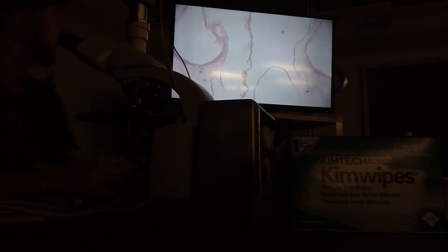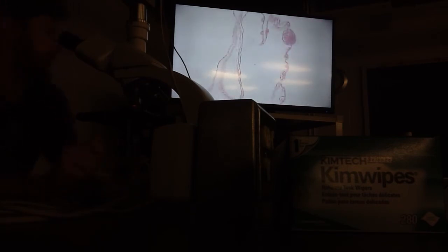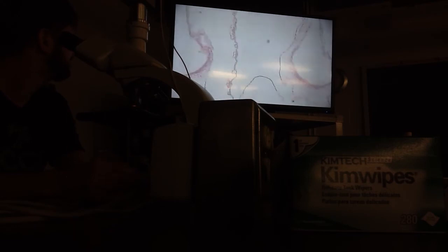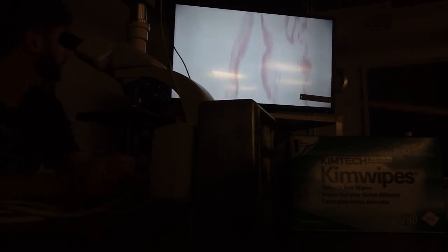Ouch. All right, he's going to start cutting through now, and I'm going to ask him to stop in a moment. Start cutting. Here's the cut, striking the top of the head of the embryo. Stop right there. Okay, so we're striking the top of the head of this embryo.